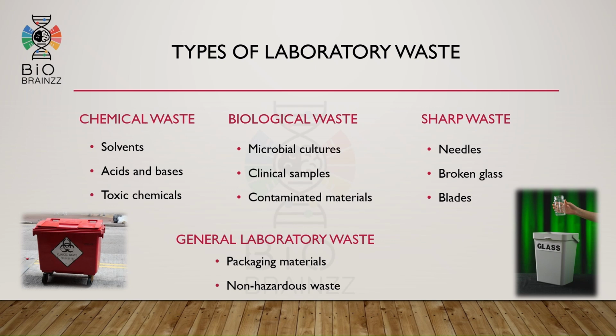Laboratory waste is classified into different categories. Chemical waste includes solvents, acids, bases, and toxic chemicals. Biological waste includes microbial cultures, contaminated materials, and clinical samples. Sharps waste includes needles, broken glass, and blades. General laboratory waste includes packaging materials and non-hazardous waste. Each category requires a specific disposal procedure.